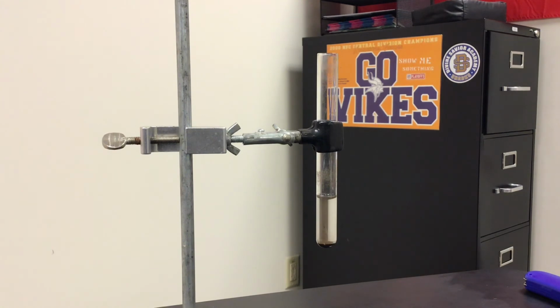So this is how the test tube looked after a night of settling. As you can see, the manganese dioxide is still at the bottom, and relatively I would say the amount of it still did not change. Although I did not measure the mass, so I can't really say that, at least visually it did not change a huge amount, or I don't think the amount really should change. So that is the catalyst throughout this reaction.